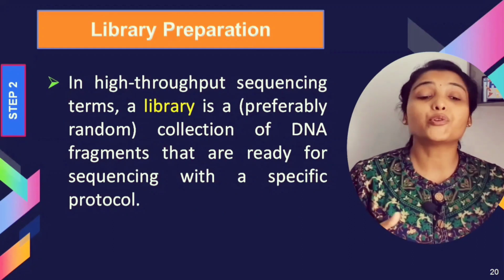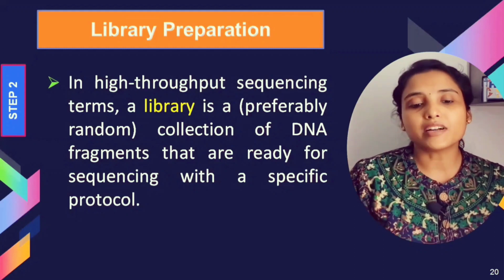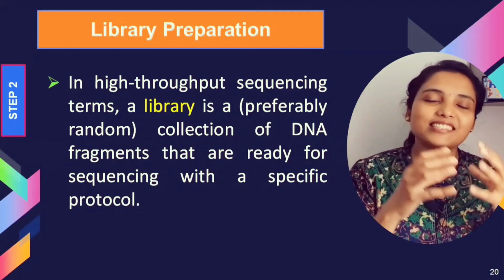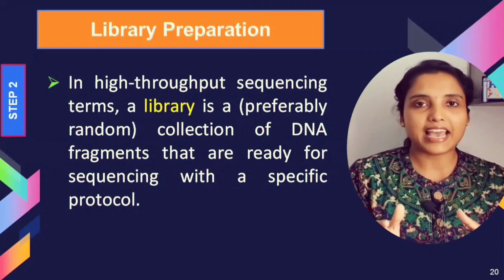Okay. Now, what is a library? In high throughput sequencing terms, a library is nothing but a random collection of DNA fragments that are ready for sequencing with a specific protocol. That's it. You're just making your sample ready to be sequenced. That is what is happening in library preparation.